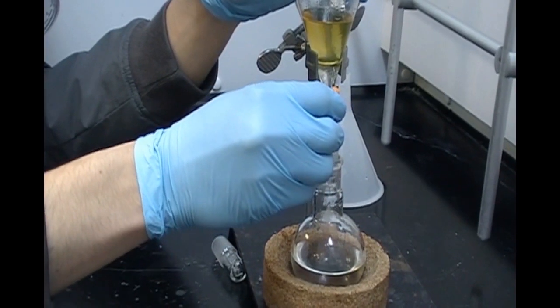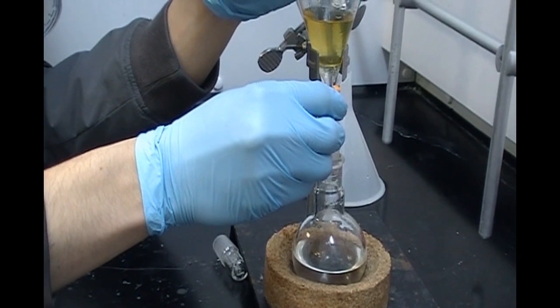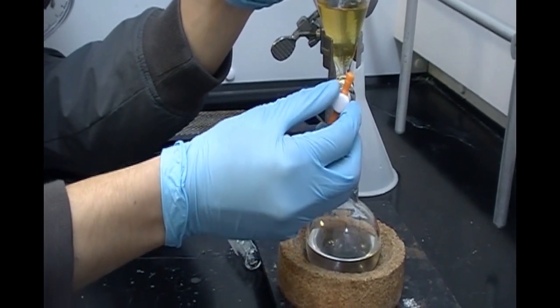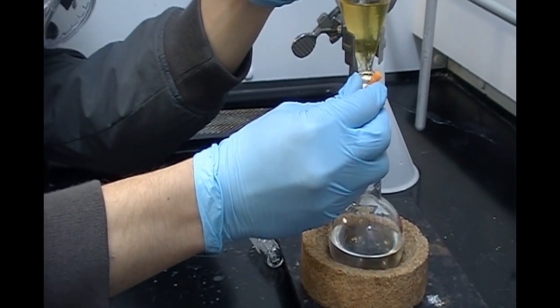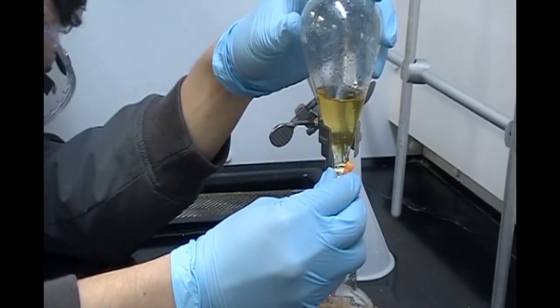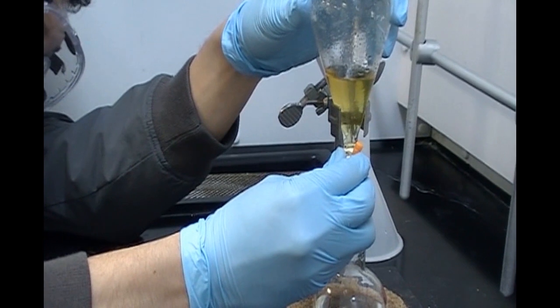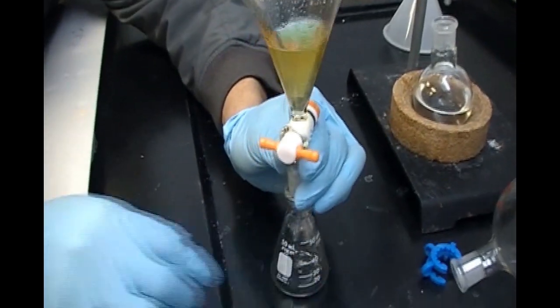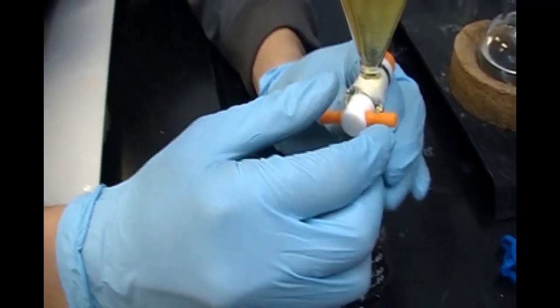We then proceeded to wash 2 more times with 5% sodium bicarbonate, repeating the same process. Don't let it seal.